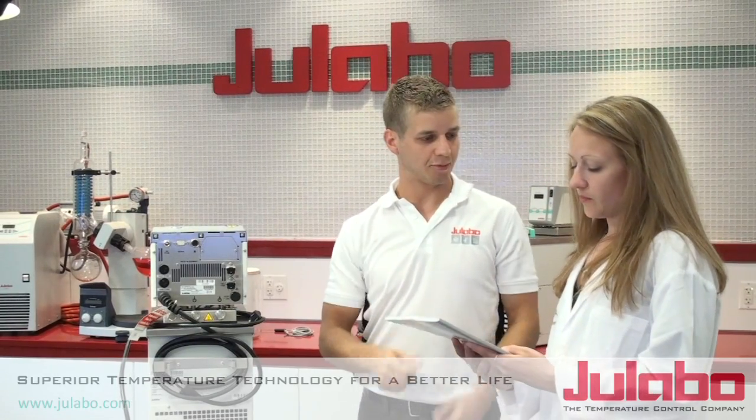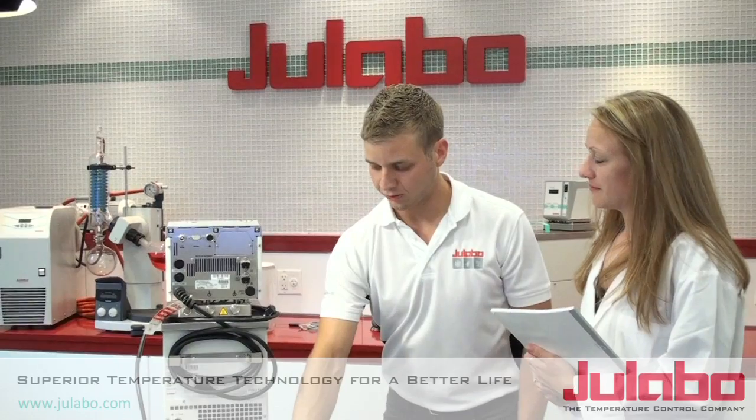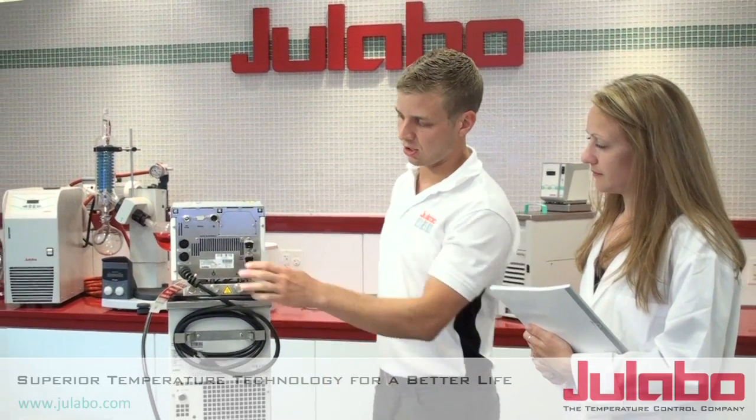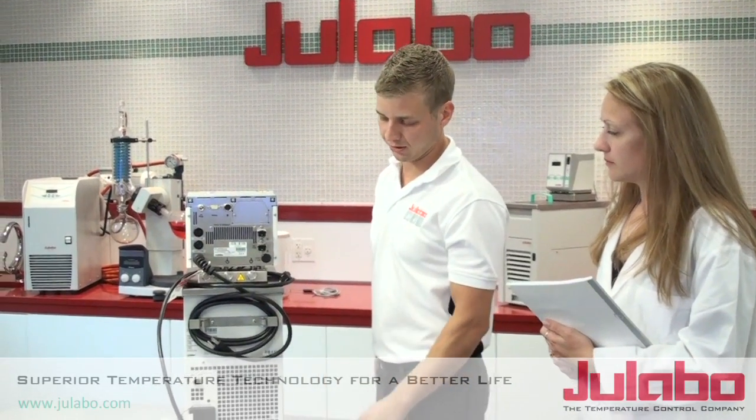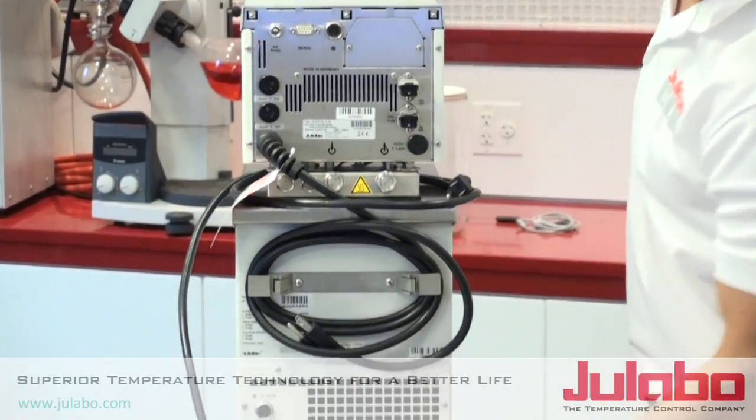I'll let you hold on to that — your operating manual — just keep that on file. So first we want to make sure that all the electrical cables are installed properly: no severed wires, no loose connections.